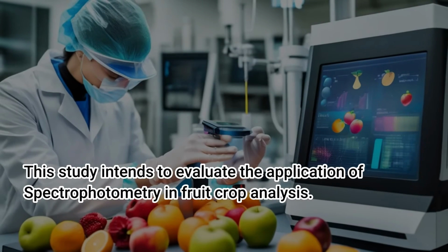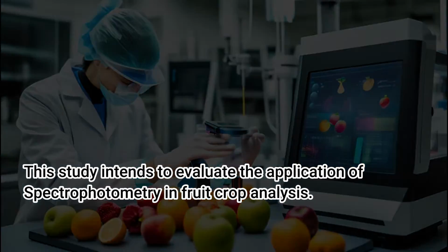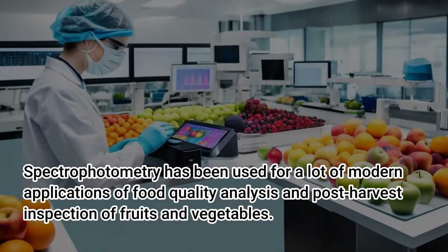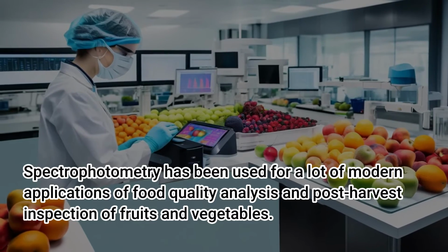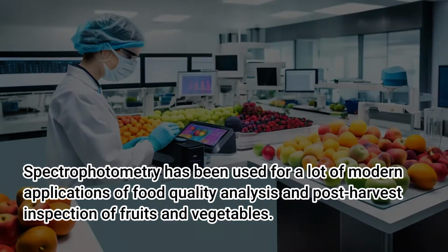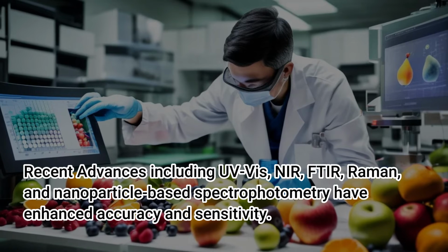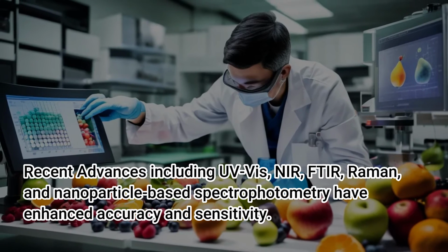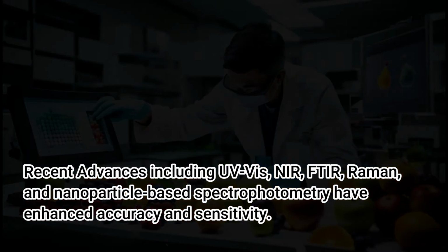This study intends to evaluate the application of spectrophotometry in fruit crop analysis. Spectrophotometry has been used for a lot of modern applications of food quality analysis and post-harvest inspection of fruits and vegetables. Recent advances including UV-Vis, NIR, FTIR, Raman, and nanoparticle-based spectrophotometry have enhanced accuracy and sensitivity.